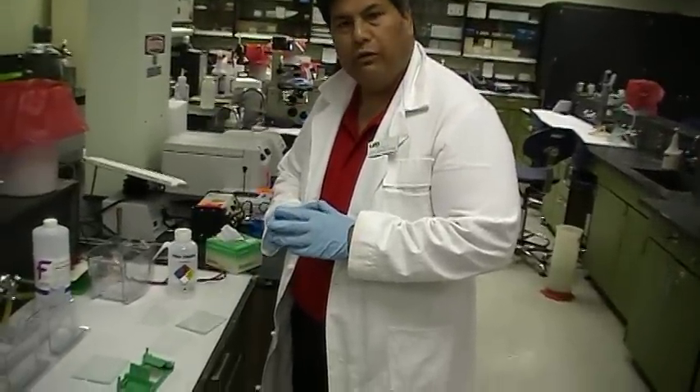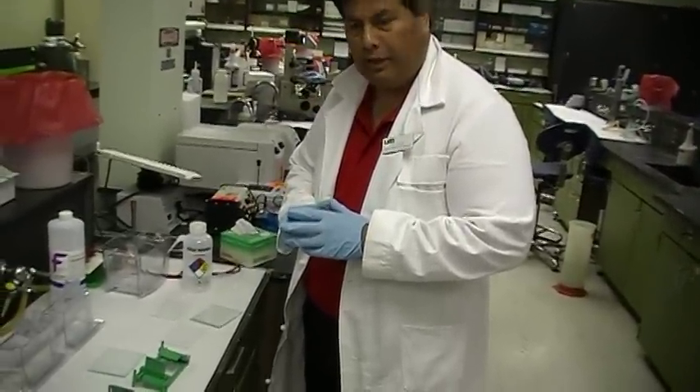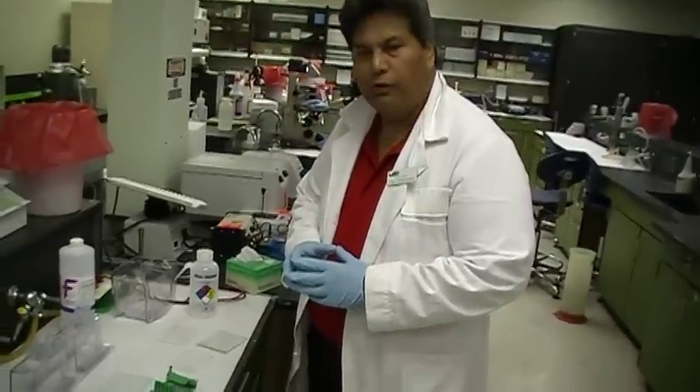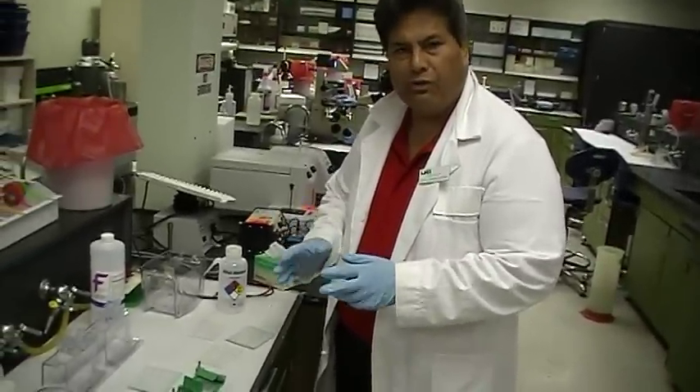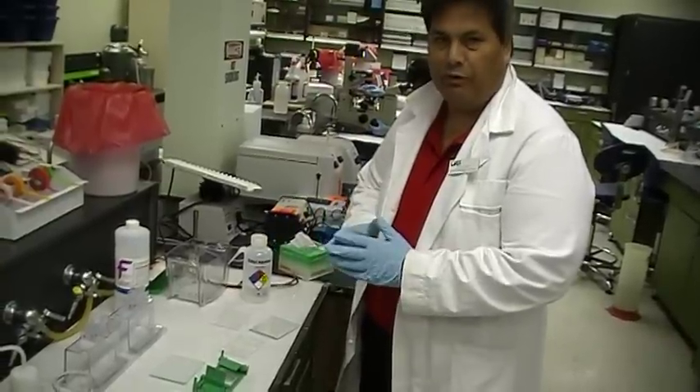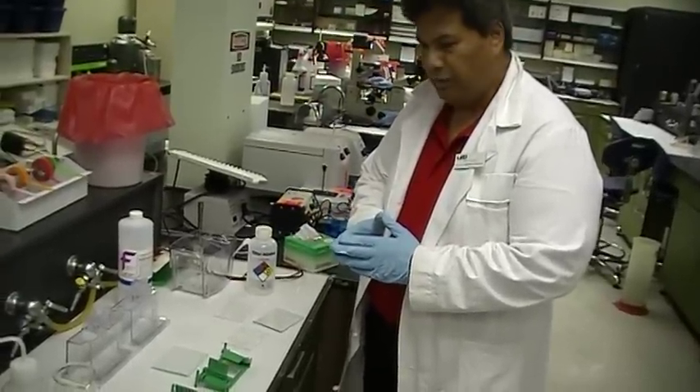Today I'm going to show you how to set up an acrylamide gel. This one is a little bit more involved than the agarose gel, so we will not actually pour a gel, but I will take you all the way up to the point where you pour a gel. I'm going to show you what to do.